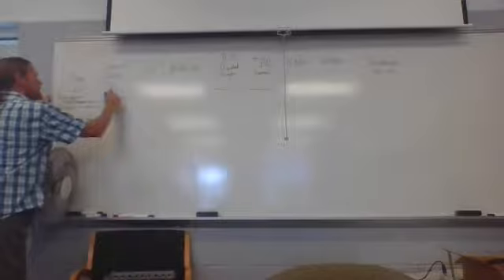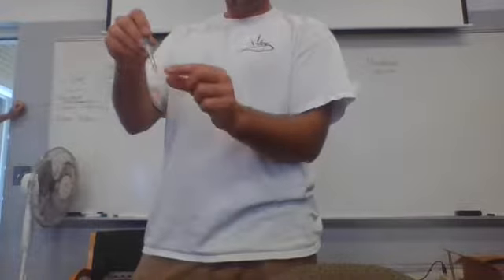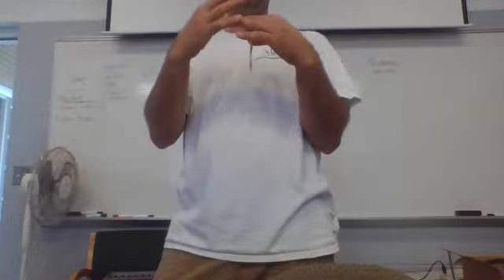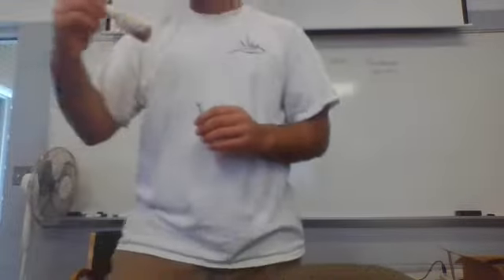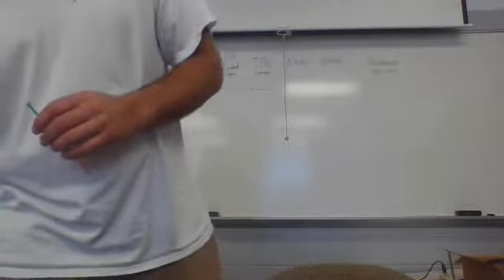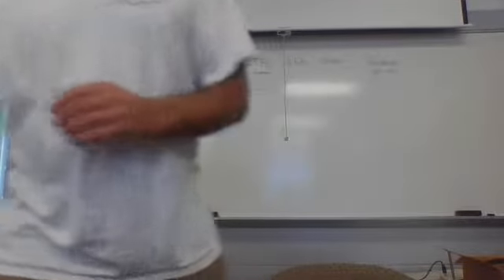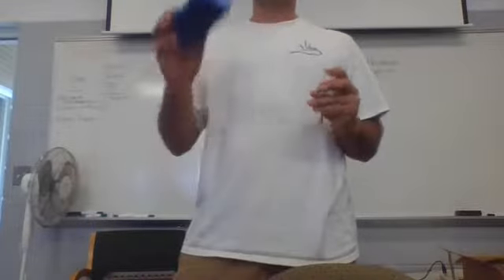And so these are these little titrators. They have a scale on them. You fill it up with a reagent and you squeeze it out till you see a change in color, right? So that's what a titration is. You mix two things together till there's an endpoint or a color change. And so you can do that with salinity. Again, there's a demineralizer and then two reagents, which have definitely leaked all over this thing because they're old. So there is a salinity titration. That is one way to measure it. Does this seem like the easiest way to measure it? No. Okay, let's think of an easier way.